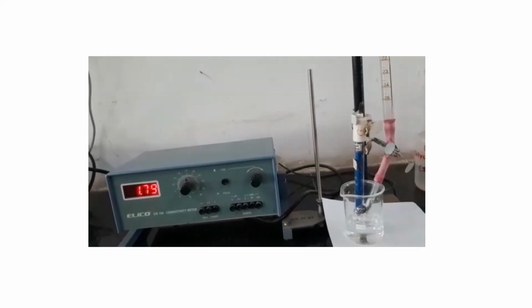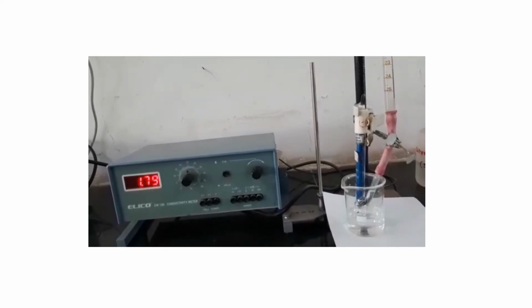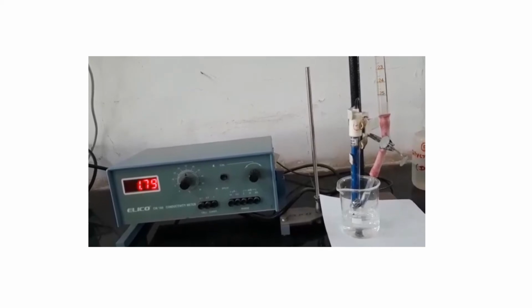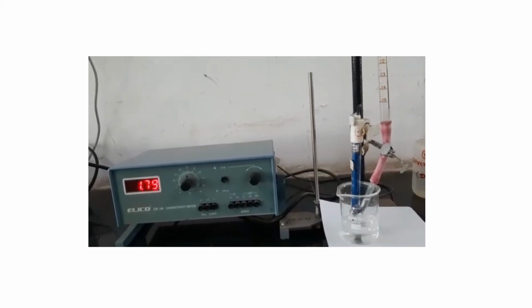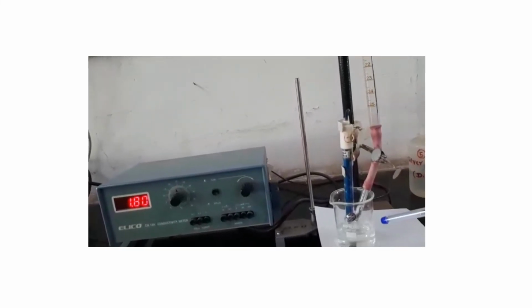Students, today we will see the practical acid-base titration by conductometric measurement. Now you can observe here, this is the conductometer, then here is a beaker.